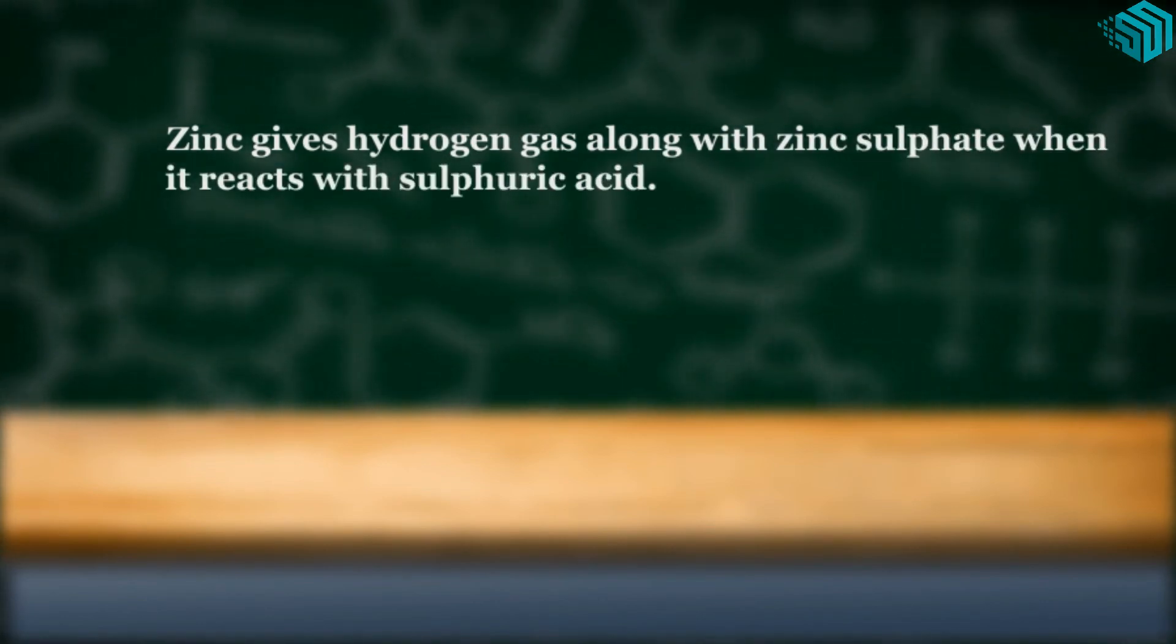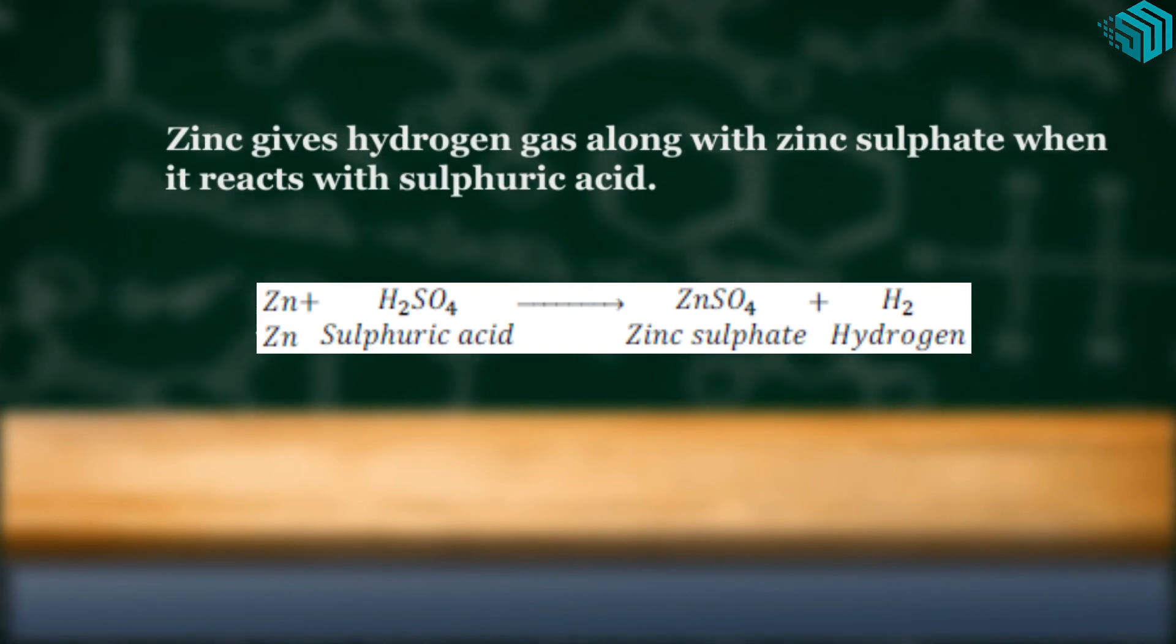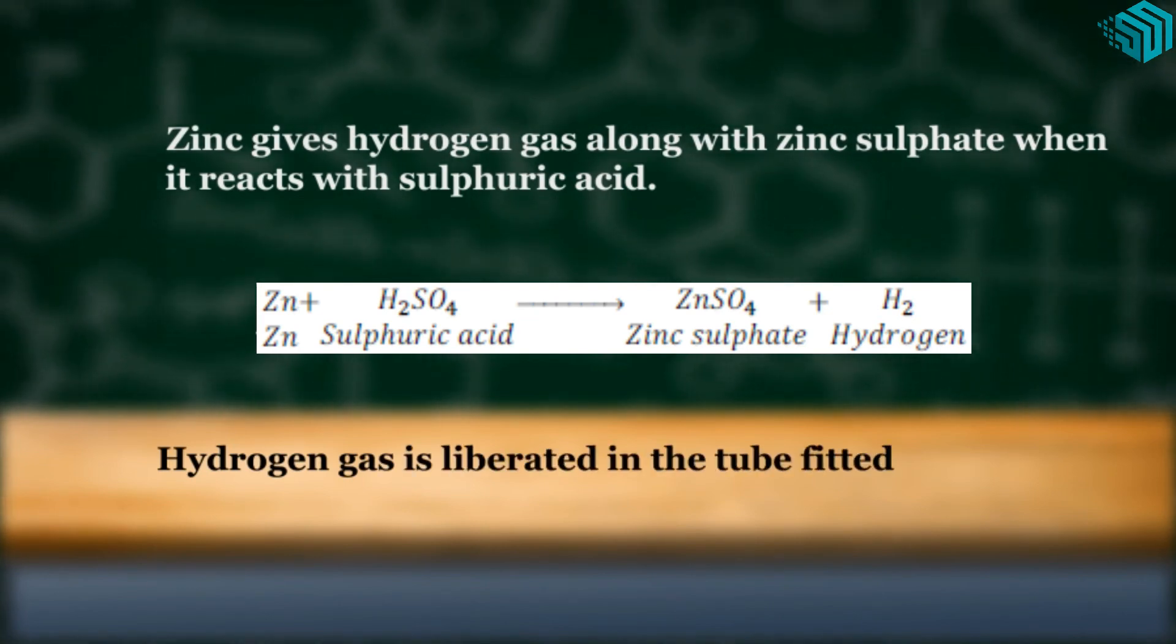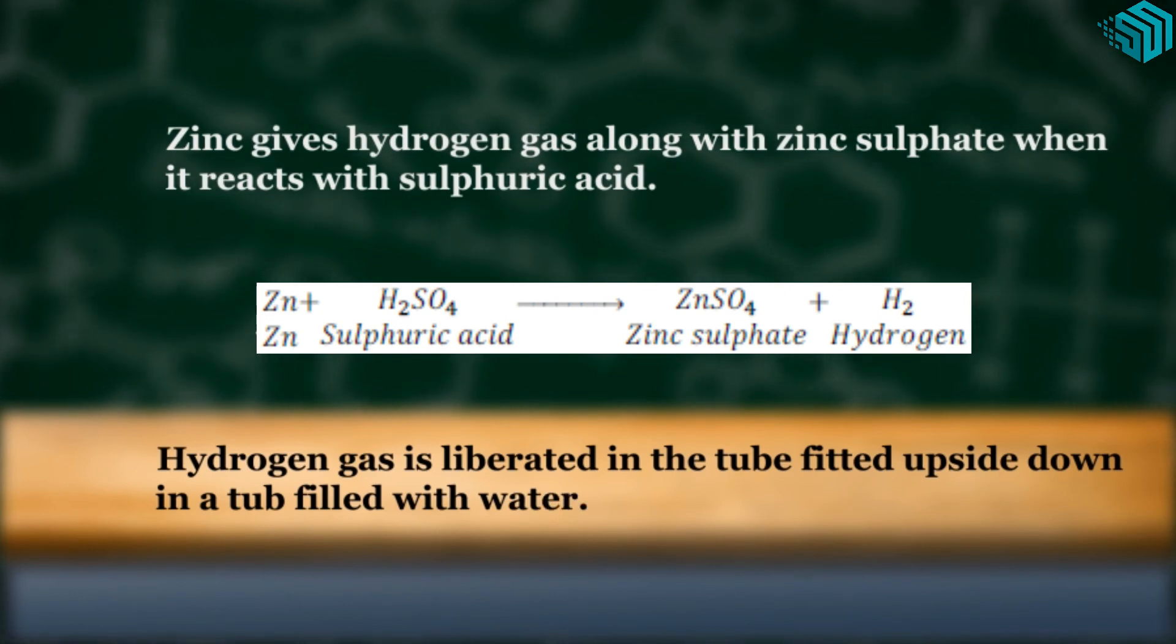Zinc plus sulfuric acid gives us zinc sulfate plus hydrogen. Hydrogen gas is liberated in the tube fitted upside down in the tub filled with water.